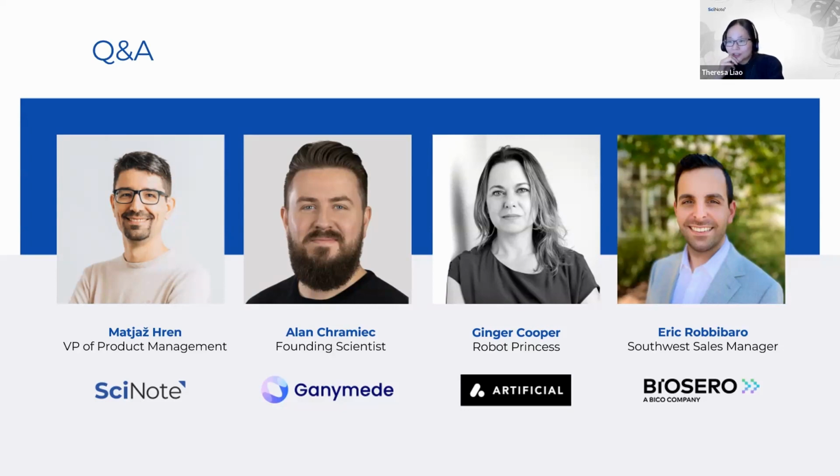And we'll start with Matjaž, perhaps. What are your thoughts? Like, what are these processes? Do they add to it? Do they make it more difficult? Yeah, so using any kind of software solution or automation solution in any type of regulated environment, whether it's a GMP, GLP, or something else, adds to the level of complexity and also adds to the level of service that the automation platform or software needs to provide, right?